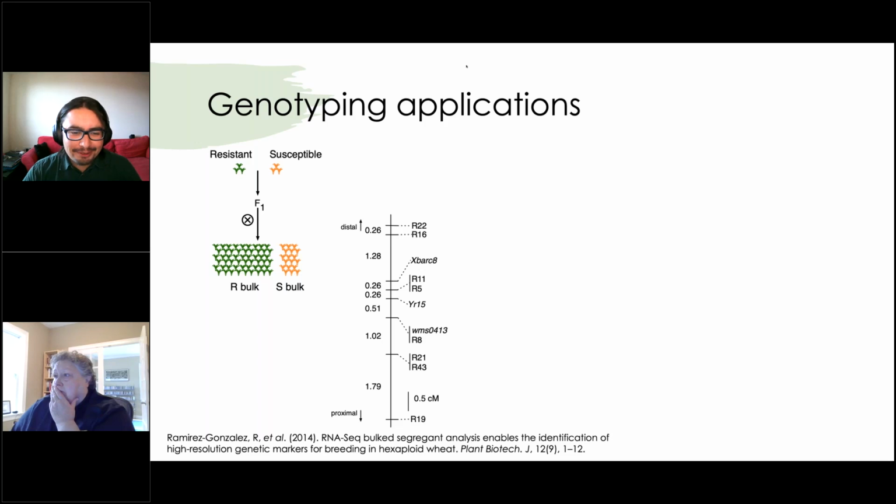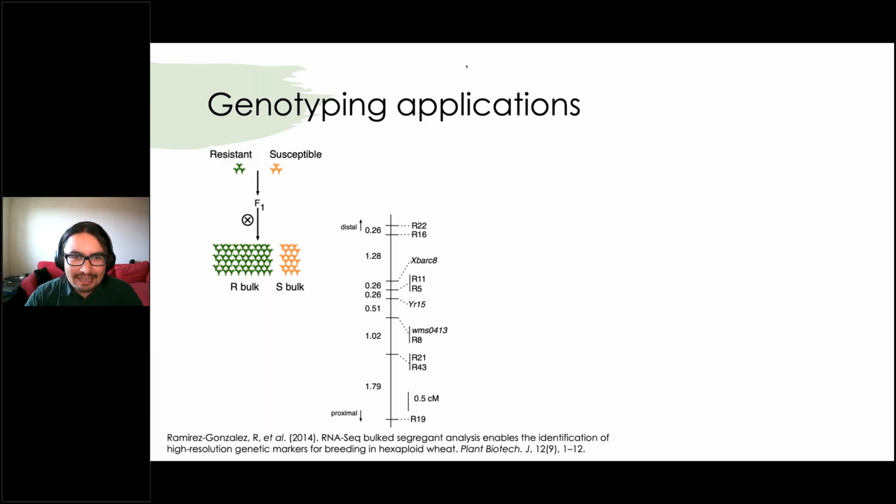I remember in those early days, my supervisor said, "Oh, you can do this manually. You can find your SNPs and design your primers manually." But it is a very labor-intensive job, and I thought, I'm going to make mistakes. I'm careful, but after doing 10, 20, I will go crazy. So I decided to automate it using my computer science background, and that's how PolyMarker was born.